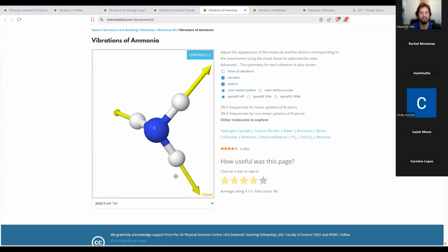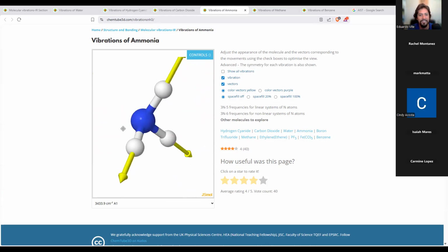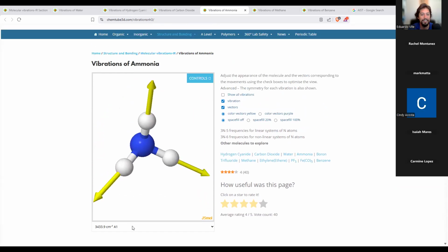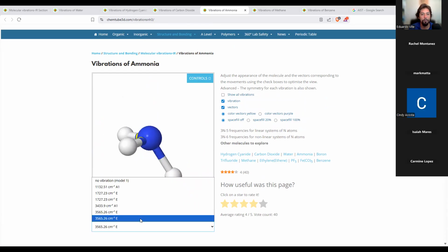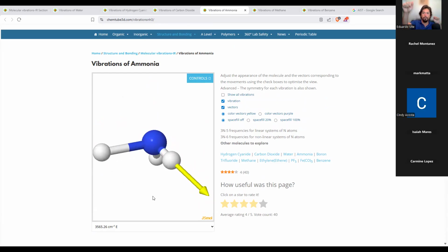Here's another one. Oh, that looks nice right there. Look at that. You just want to wake up and, like, Mr. Incredible, just have someone stretch your back out like that. That would be nice. Yeah, very nice. So this is the symmetric stretch at 3433. There's another one that is asymmetric, right? The arms are coming in and you're stretching out your back. And then there's one more where one of them's not even stretching and it's really just only your shoulders are moving and your torso is standing still, right?